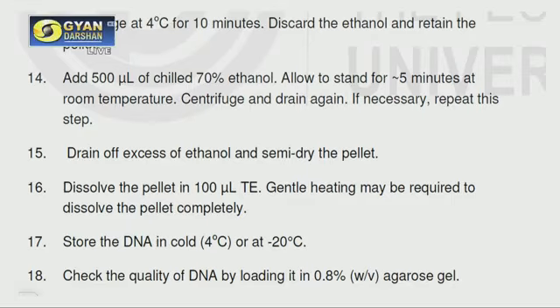Why do you need this washing? Because you need to remove the associated salt mostly. Allow it to stand for 5 minutes, and then again centrifuge, drain off the excess ethanol and semi-dry the pellet. Finally, dissolve the DNA pellet in 100 microliter TE buffer pH 8. Gentle heating may be required to dissolve the pellet completely. Then store the dissolved DNA at minus 20 degrees centigrade.